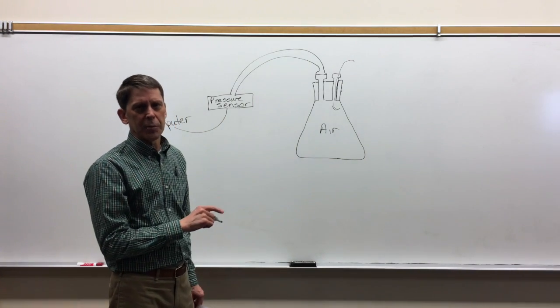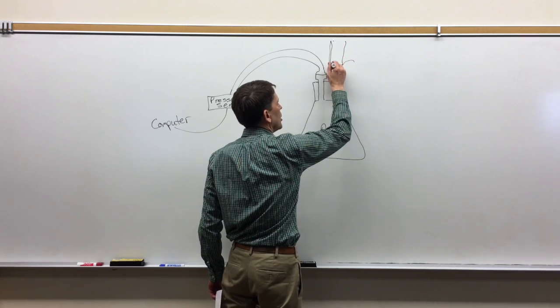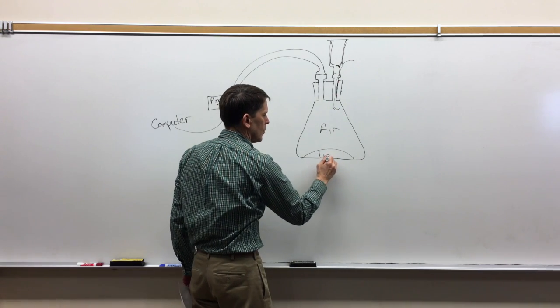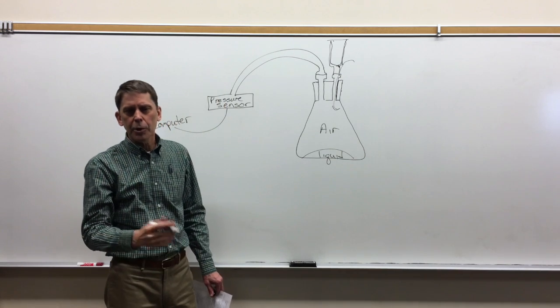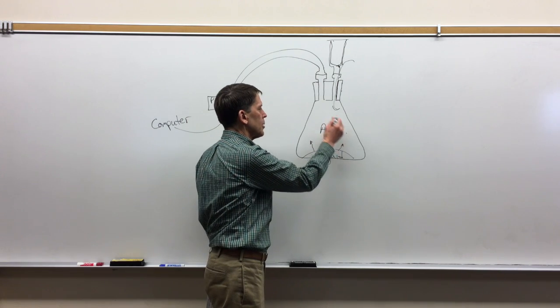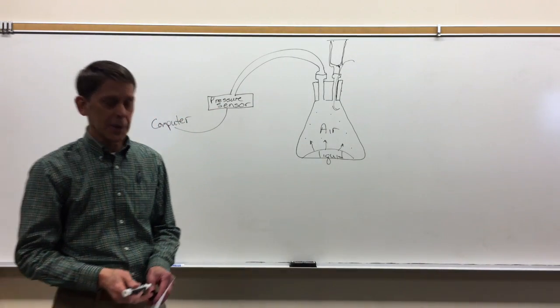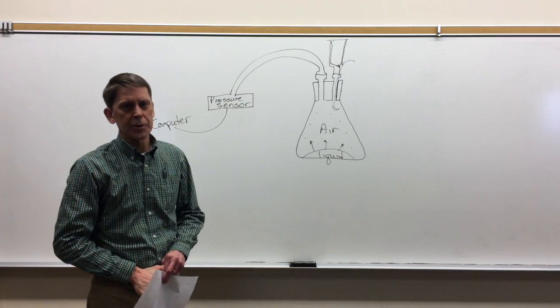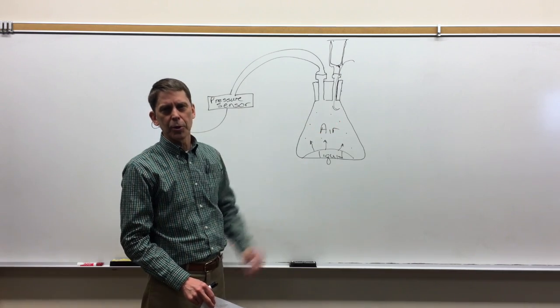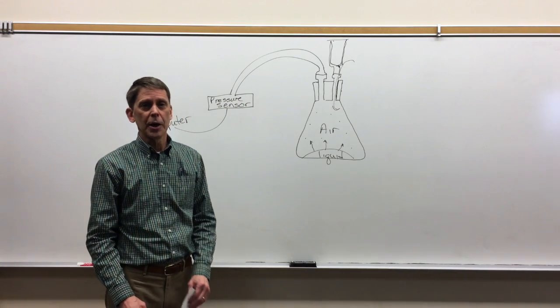Then, after measuring that atmospheric pressure, we'll connect a syringe here with a plunger and add liquid. After the liquid's been in there for a little bit, some of the molecules of the liquid will evaporate, and we'll get molecules of that gas in the vapor phase, in the gas phase with the air. So then we'll be measuring the air pressure and the vapor pressure, and then you'll do a calculation to determine the vapor pressure of that liquid afterwards.